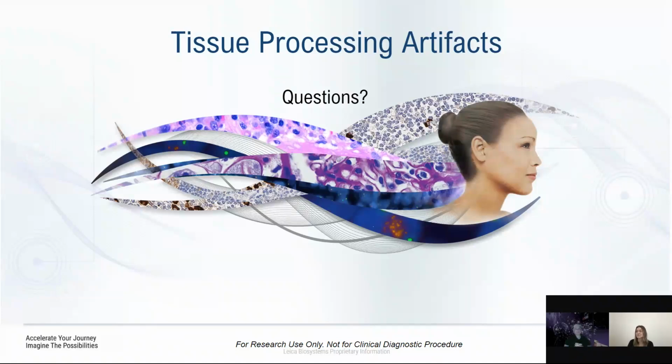All right. Now, this user asks, sometimes sections do not catch the stains properly. Sections are understained apart from incomplete dewaxing. Are there any other reasons? Yes. If the tissues have been fixed for longer than the 24 hours, if you've been holding it for a long time in PFA or in NBF, that can also affect your H&E staining.